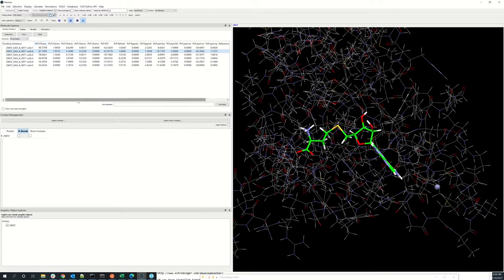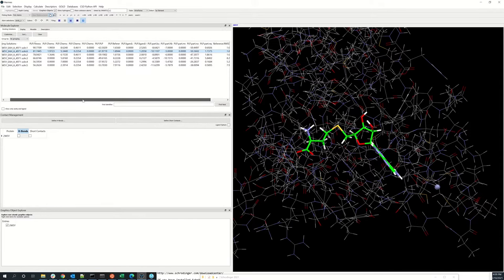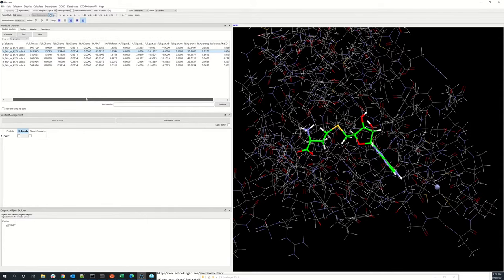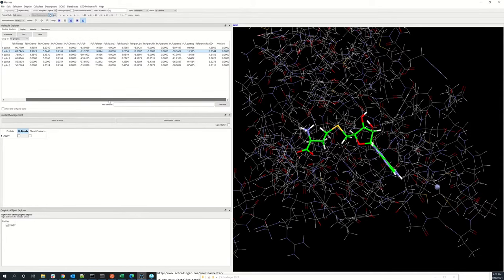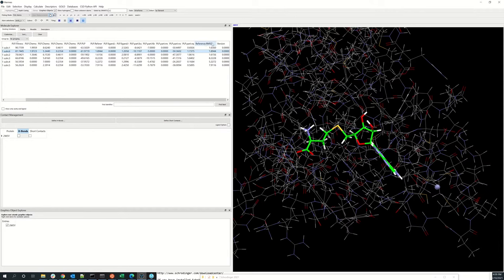Then you can scroll to the right and take a look at the breakdown of the terms. If you had a reference ligand that comes with the calculation, you can have the reference RMSD tab output here.